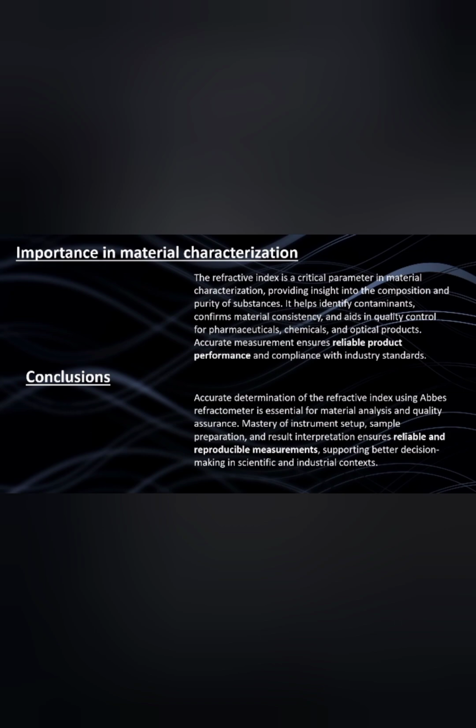Conclusions. Accurate determination of the refractive index using an Abbe's refractometer is essential for material analysis and quality assurance. Mastery of instrument setup, sample preparation, and result interpretation ensures reliable and reproducible measurements, supporting better decision making in scientific and industrial contexts.